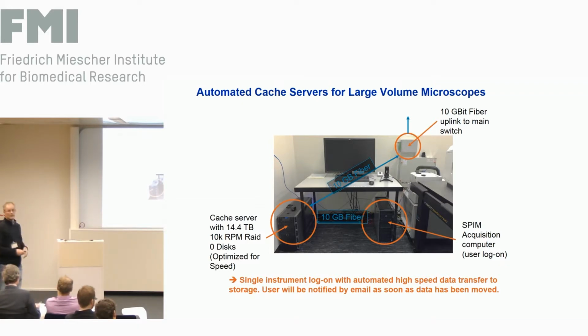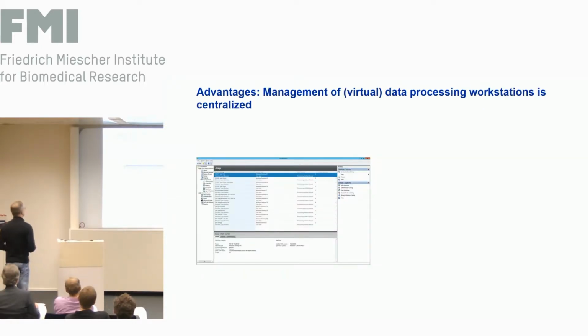What we implemented, because there's no clue what the microscope companies are doing with the data. Sometimes they access the data while it is still imaging. So we tried to move it and we had crashes. So we don't touch the data anymore. As soon as the experiment is finished, the user logs out, and the data is transferred automatically. The same technology as Dean was describing, it is safe. At the end of the transfer process, users are informed. So it basically works quite nicely.